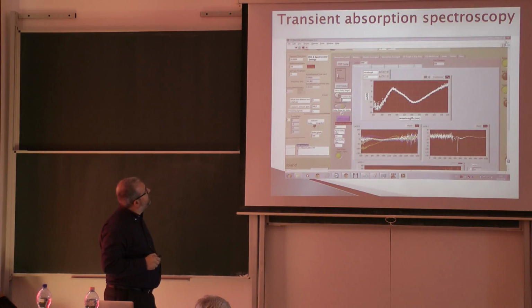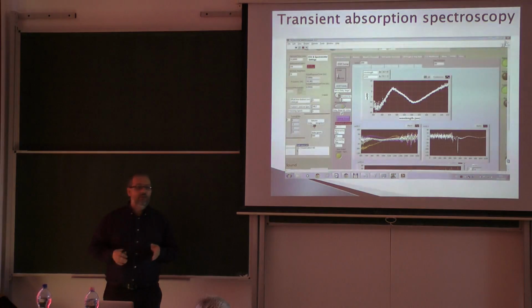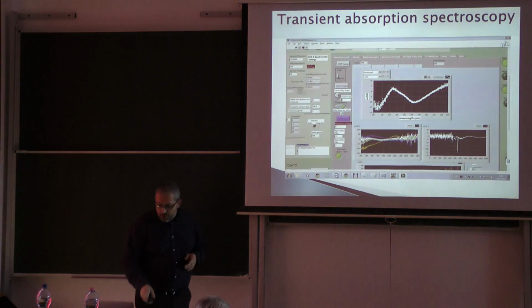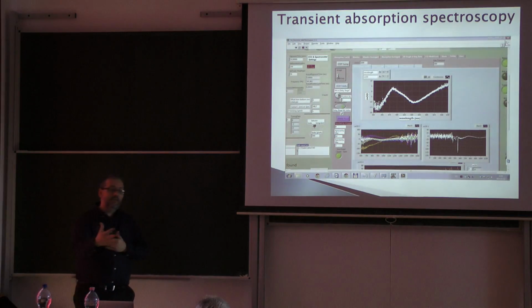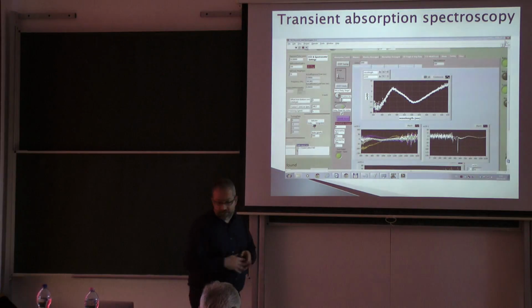Typically one measurement goes to, well, 25 minutes. This is the shortest measurement, and we can have longer measurements. Let me show you just an example of these measurements. What is the primary data we can get after a measurement like this?